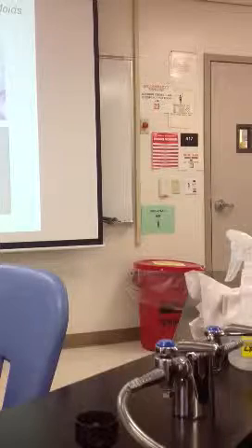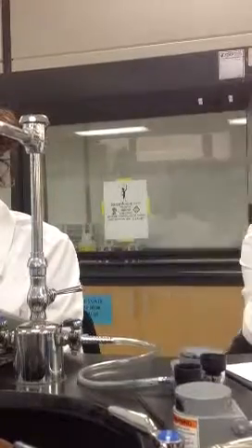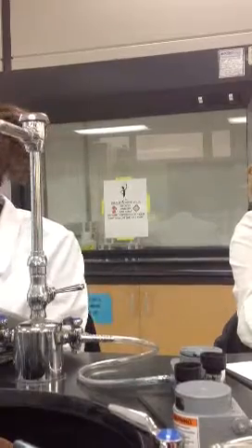Now, in order to have a complete set of data, we need all the molds. So we're kind of counting on each table to at least have a good mold culture from one of them, right? So that when we do our observations, we have something to look at. So the way I'm going to do this, that table is going to be responsible for this one, the Aspergillus, okay? This one, the middle table is going to be responsible for the Penicillium, right? Which kind of connects into this one. Okay, so anyway, this is going to be the Penicillium.